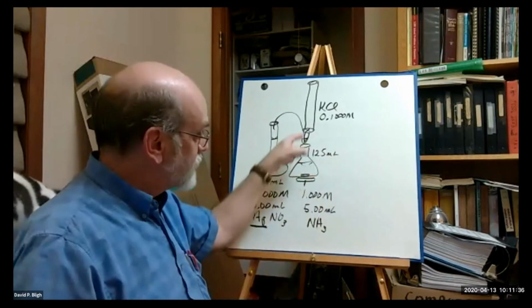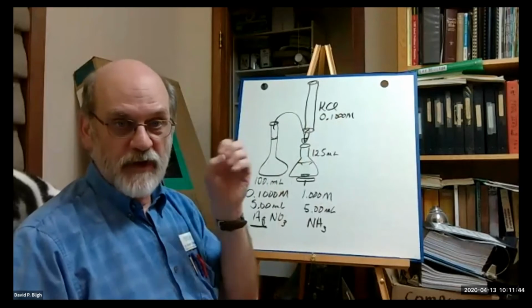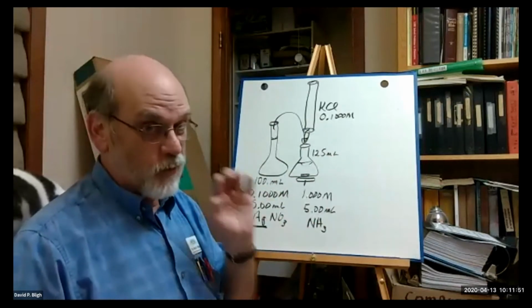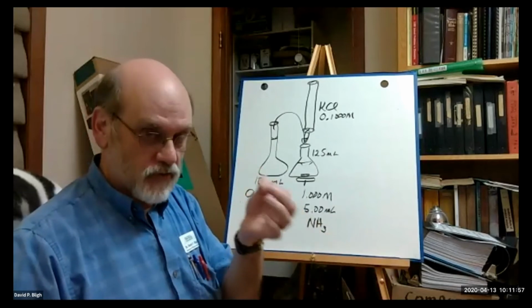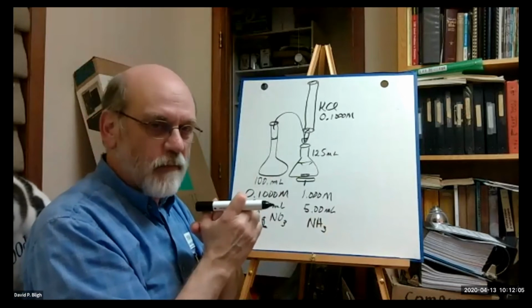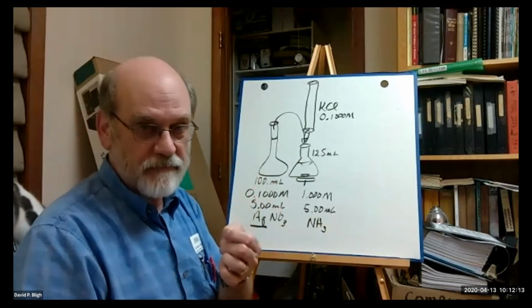Right? Whenever a drop of this hits that solution, you see it. It's very pronounced. You see that opalescence appear and then go away. But it becomes more persistent as you get closer to the endpoint. And at these concentrations, that endpoint comes really quick. It's like within 1 milliliter of addition. So you add a small drop at a time. As you add your drops, it's easy to see that, but we want to know when the faint, persistent opalescence remains. And the way to see that is with the Tyndall effect.